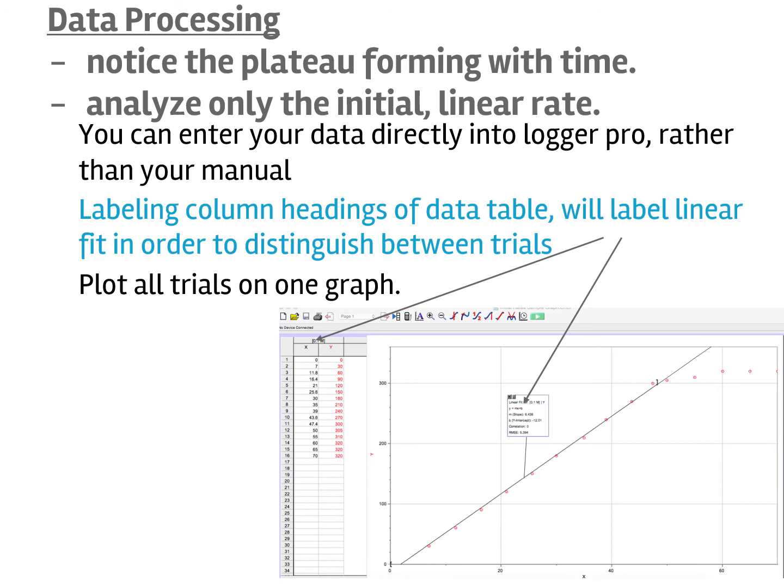So finding the slope of this here would help you define the rate of reaction for your specific run, and that should help you carry out the other calculations to determine the orders with respect to hydrogen peroxide and potassium iodide. So hopefully this was helpful, and you should be able to do the questions in your report sheet for this experiment. And good luck.